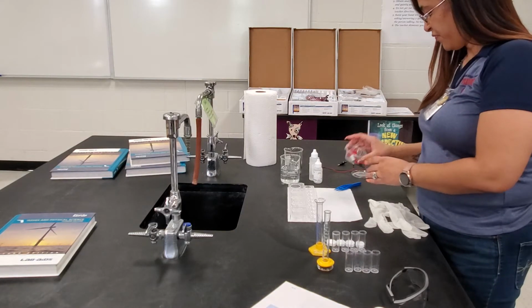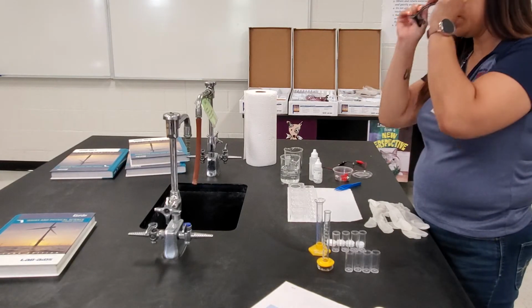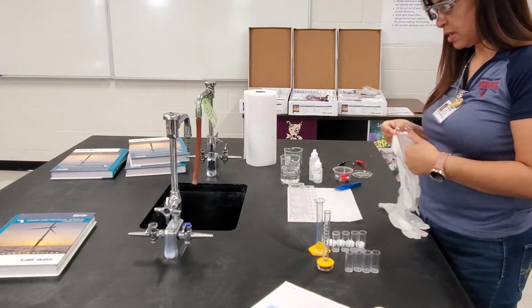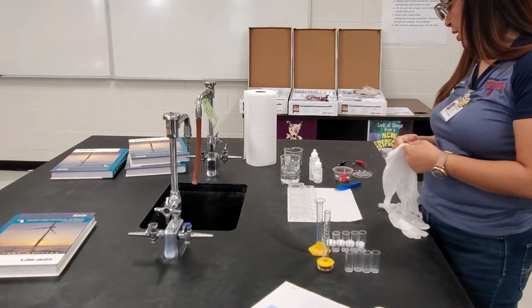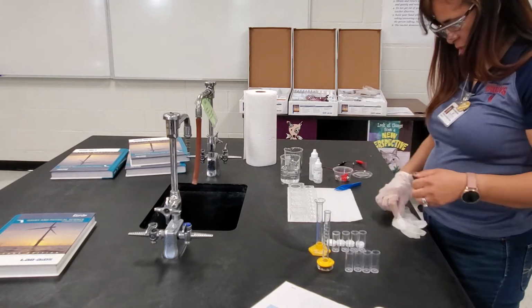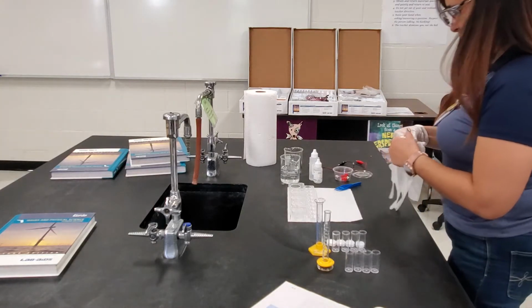So the first thing I'm going to do, of course, is put on my protective equipment, because even though the solids themselves don't appear to be hazardous, I'm going to be working with some lab-grade denatured alcohol as well as some copper chloride, and we don't want to get that in our eyes. So, gloves as well, because I don't want to expose my skin to any of that either.